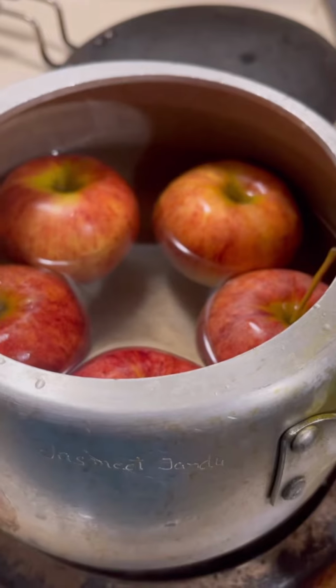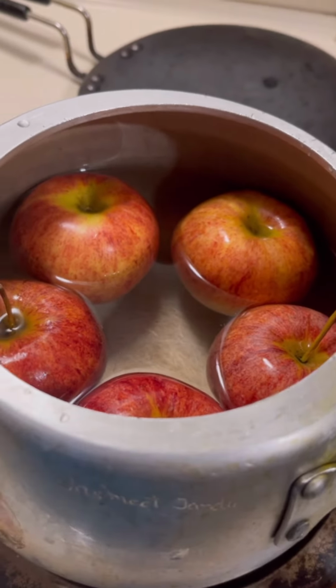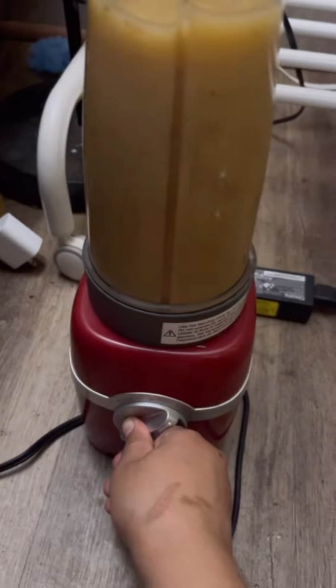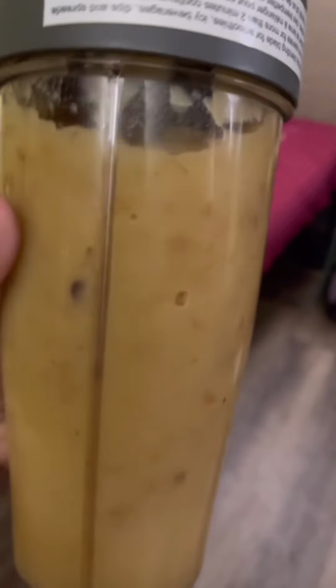For control, there was 30 ml formation of carbon dioxide, whereas for 0.15 gram of yeast, it was 35 ml, and for 0.30 gram, it was 60 ml, for 0.50 gram, it was 85 ml, and for 0.75 gram, it was 115 ml. After that, we boiled the apples for about half an hour, because there was contamination last time. So after grinding, we have mush for our week 2.